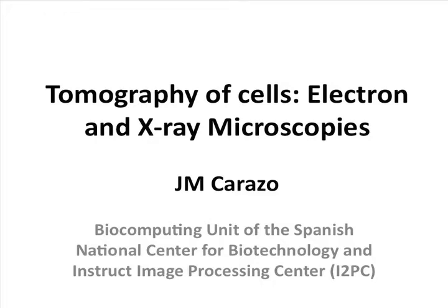I'm going to talk about cells, about cells in 3 dimensions, that's the tomography of cells, and actually about 2 important tools for that process that are electron and X-ray microscopies.